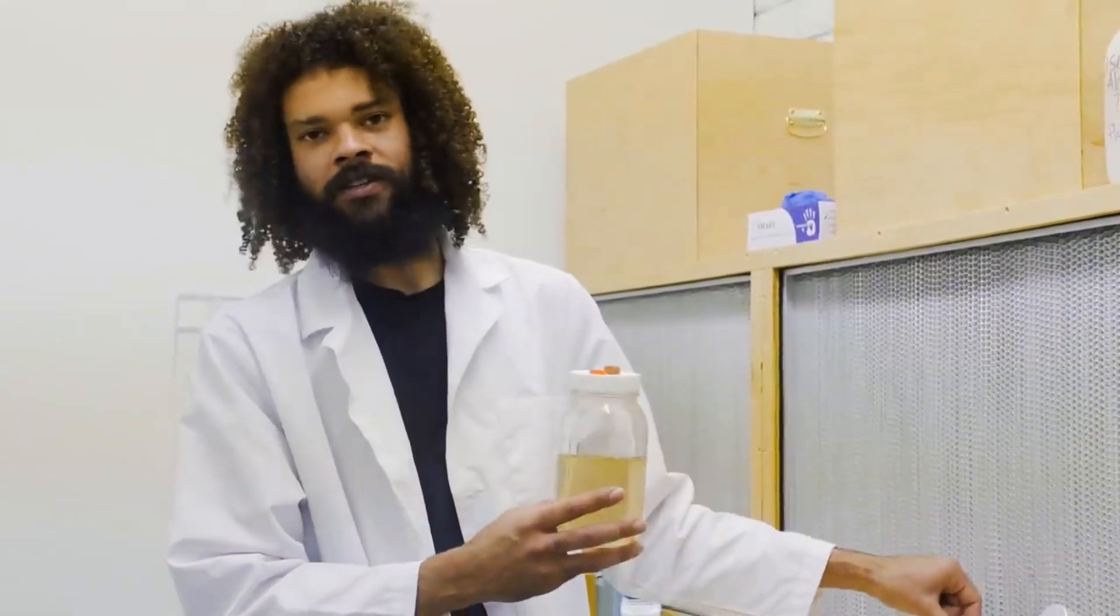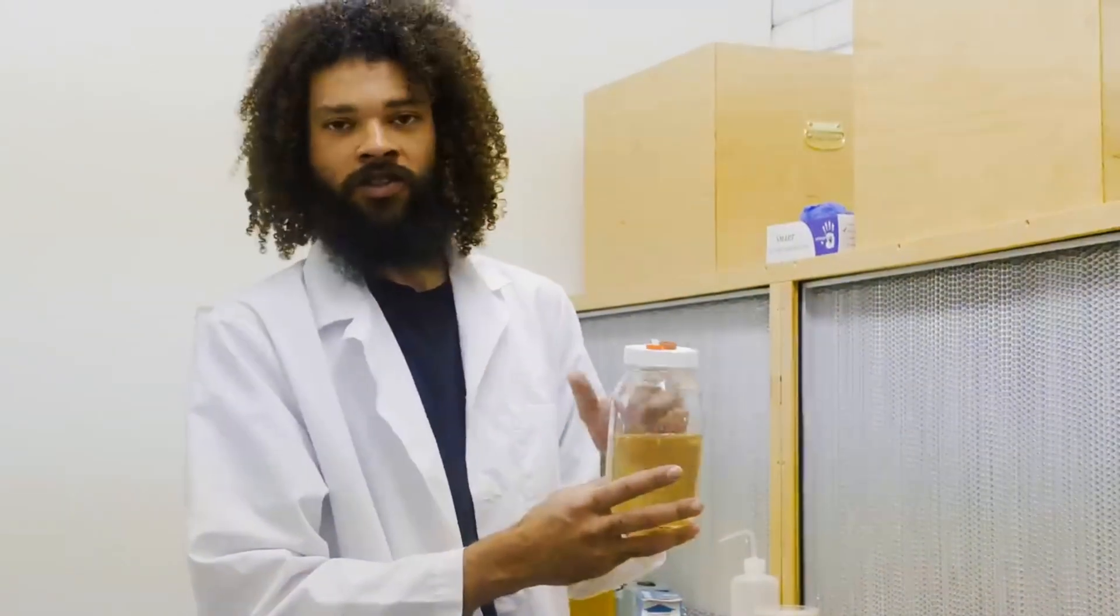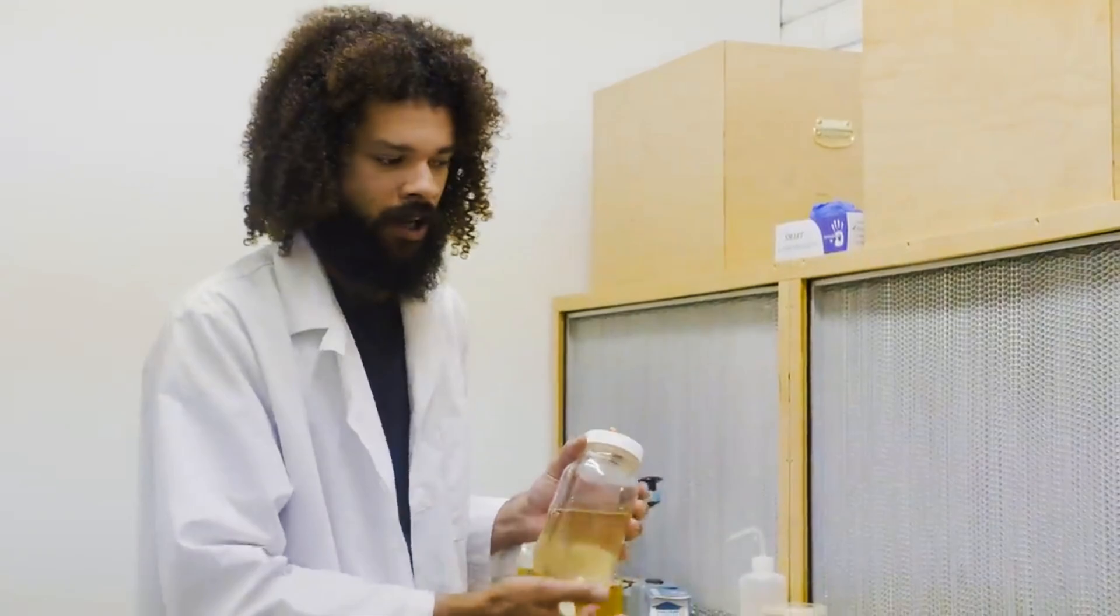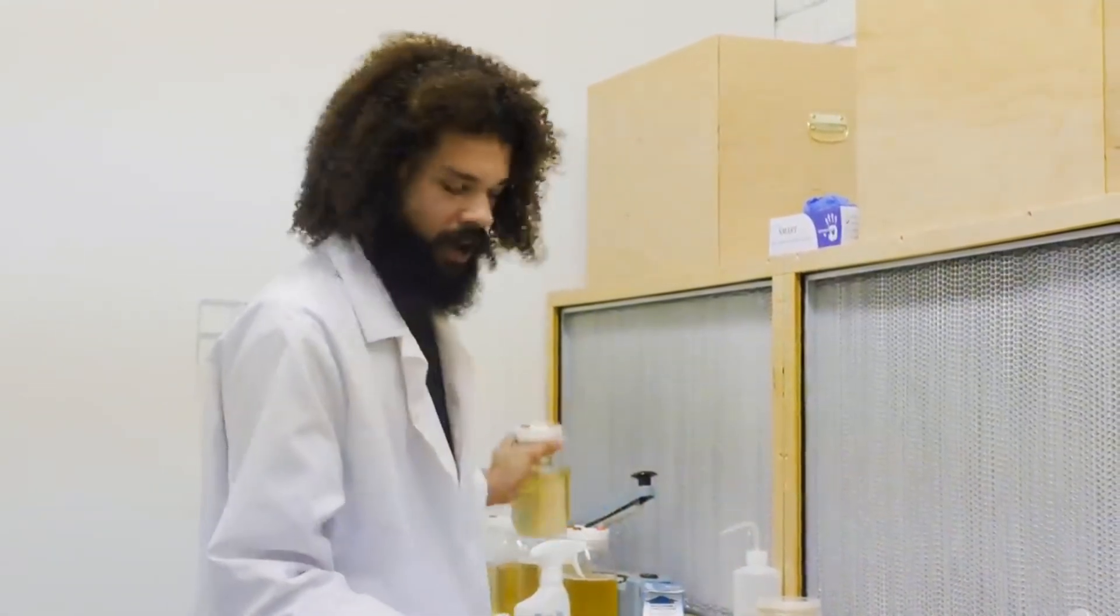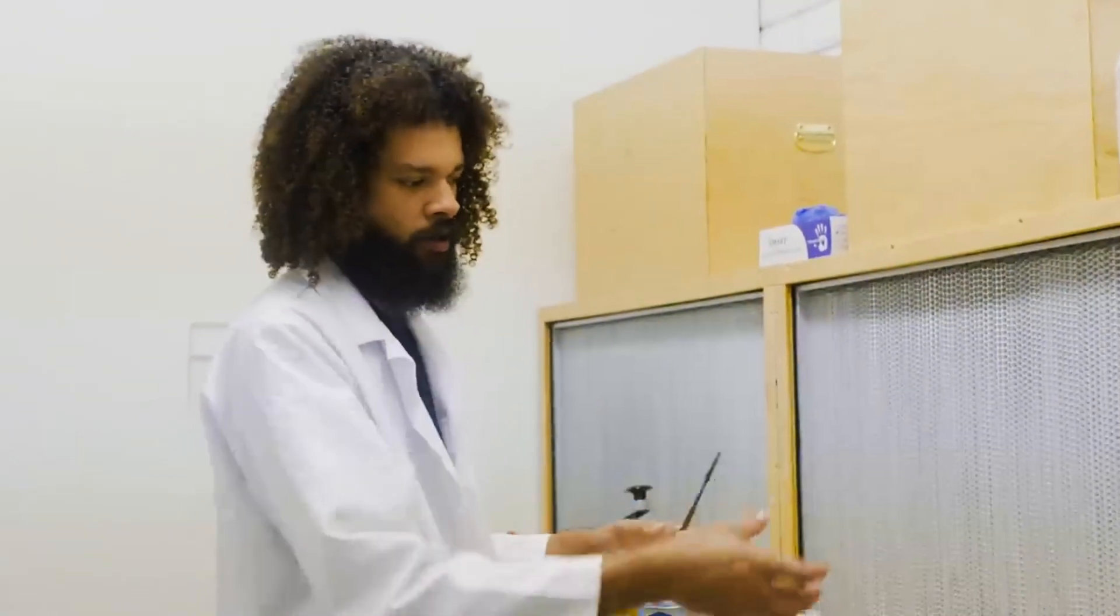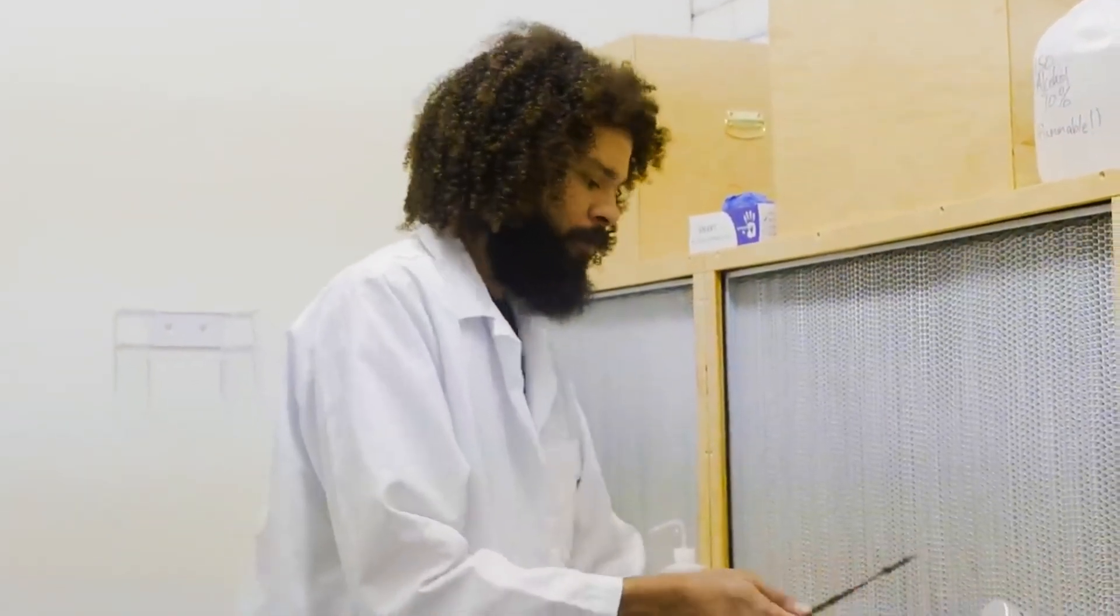Take just a tiny piece of tissue from a petri dish, drop it into a liquid culture jar, and really just expand the mycelium. I like to utilize liquid culture for expansion to be honest with you. It's really nice to be able to inoculate with liquid culture and just pour it into your spawn. You get more points of contact with liquid, but both work great.